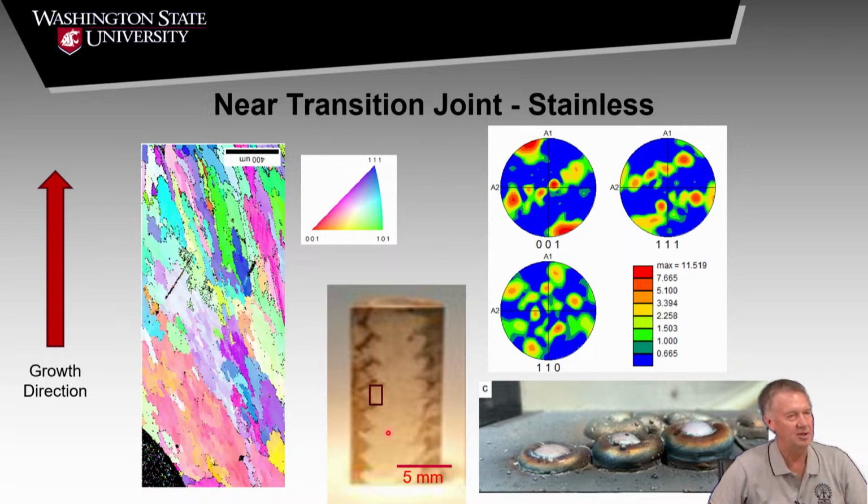Whether there's a periodicity, I mentioned it briefly when we talked about texture calculation, something called an orientation coherence function, the OCF. That says how your orientation changes as a function of position. My entire presentation here was on orientation gradients and how to quantify them. It's a great question. There are nice mathematical tools to do this. They're not in the software yet. They're pretty complicated analyses right now, but I think it's a great research question to see if that's actually the case or not.